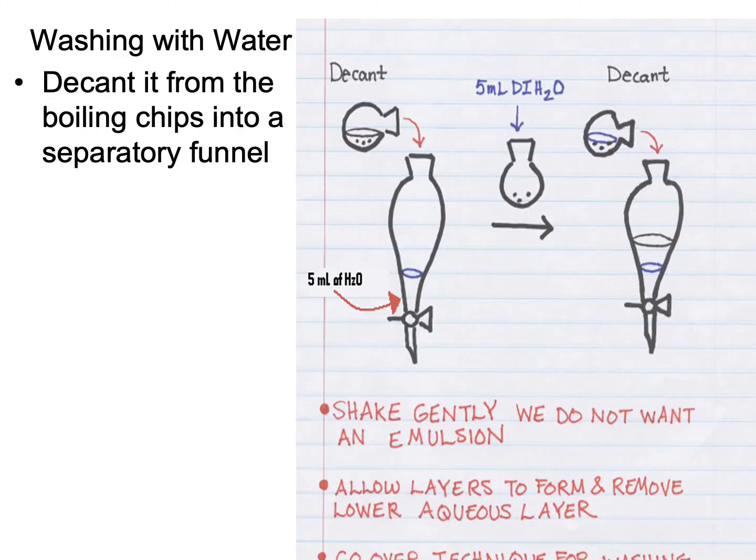In this step, you will see how we are going to remove extra sulfuric acid, extra acetic acid, and extra alcohol from the products, and how we rinse and dry the products with the use of water and sodium bicarbonate.